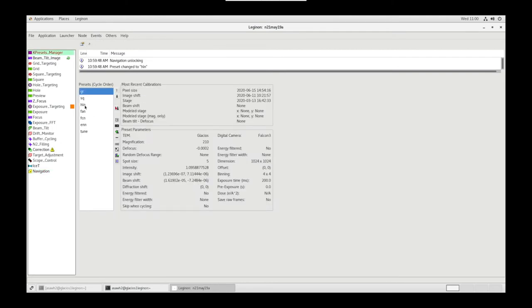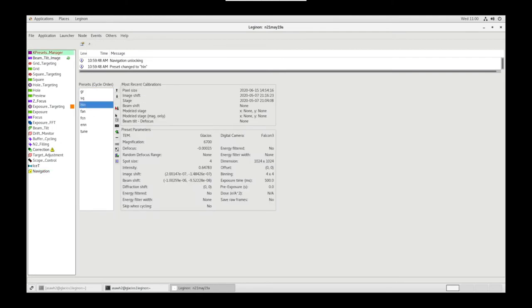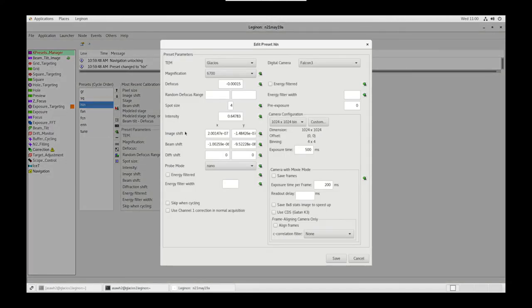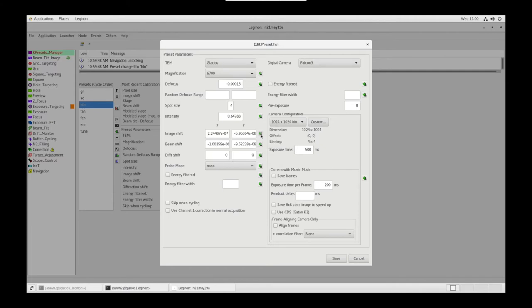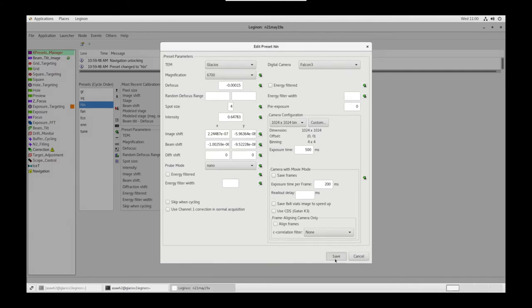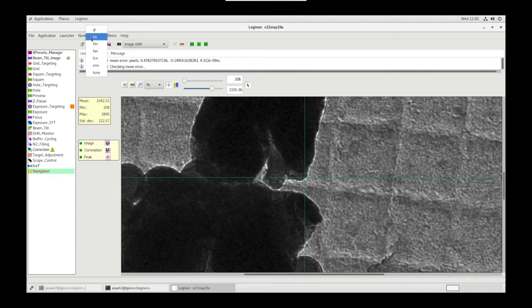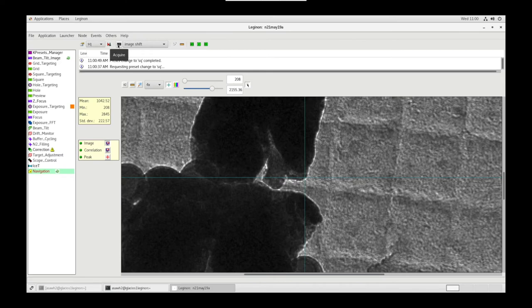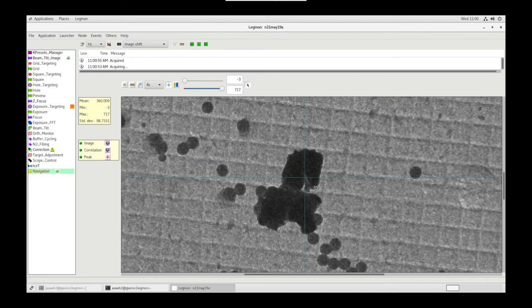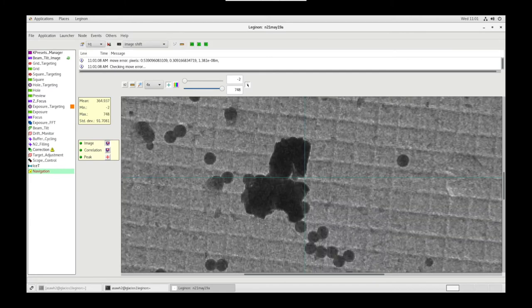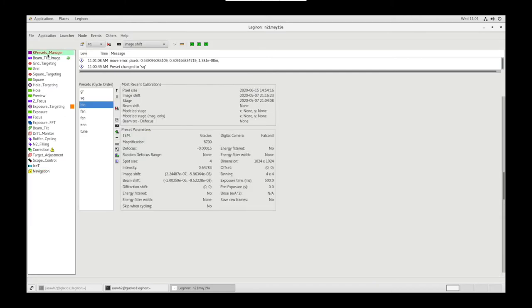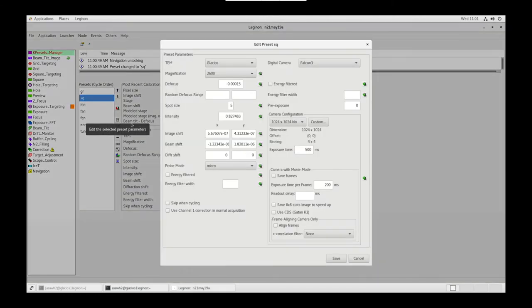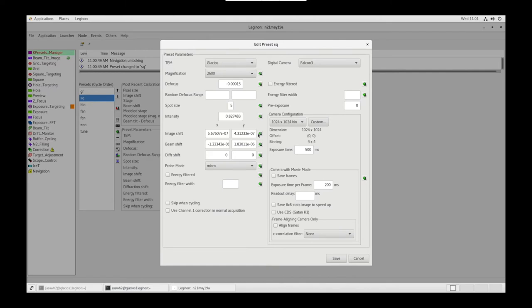In Presets Manager, let's go to the Hole Preset, Settings, and import that Image Shift that we just changed. Save. Back in Navigation, let's go down in Mag to Square, Acquire Image Shift, and repeat the process. Let's go back to that same point. In Presets Manager, let's go to Square Settings and import that Image Shift from the instrument. Save.